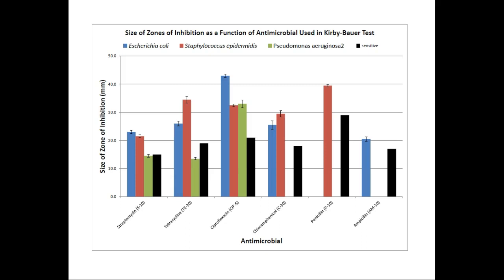And we're going to use this later. We're actually going to make E. coli ampicillin resistant. So I definitely wanted you guys to see that it is sensitive, right? Normal E. coli is sensitive to ampicillin, right? It's above the sensitivity line.